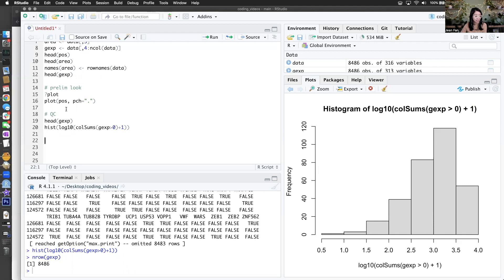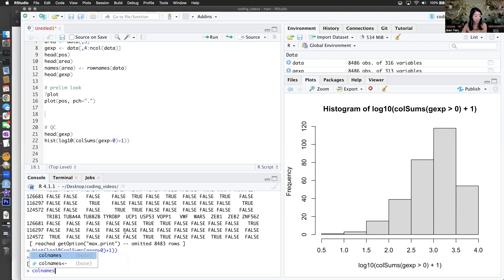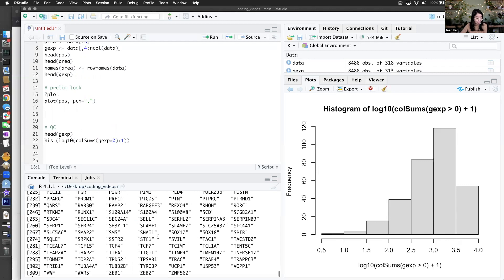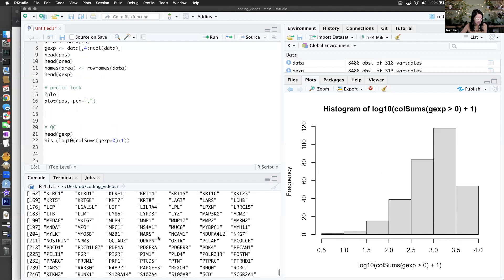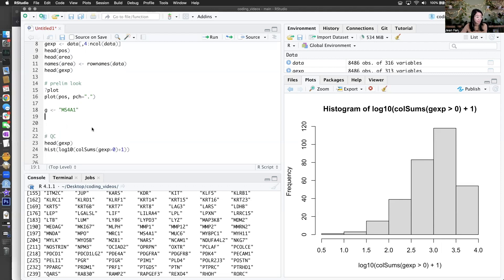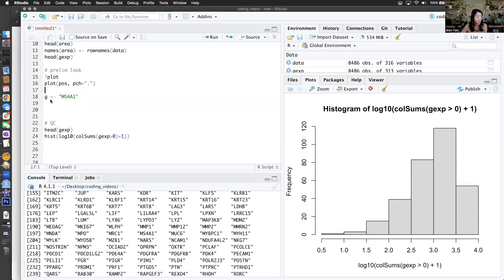Now let's also pick a gene and look at it. What's a gene that I actually recognize in here? Okay, MS4A1 — CD20 — it's a B cell marker that I recognize. Even without doing any analysis, I just want to see how distributed this gene is — which are the cells expressing it, and which are the cells that don't.